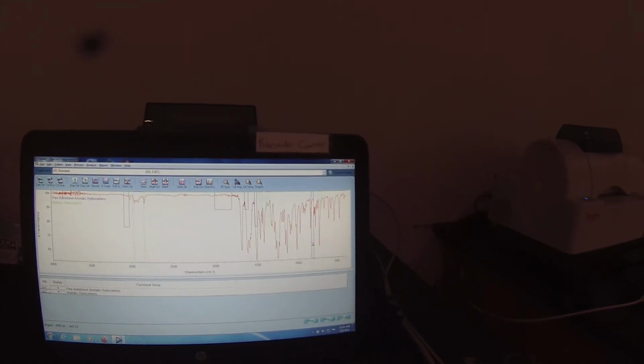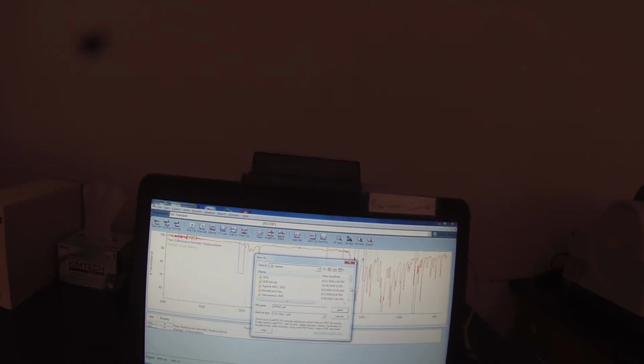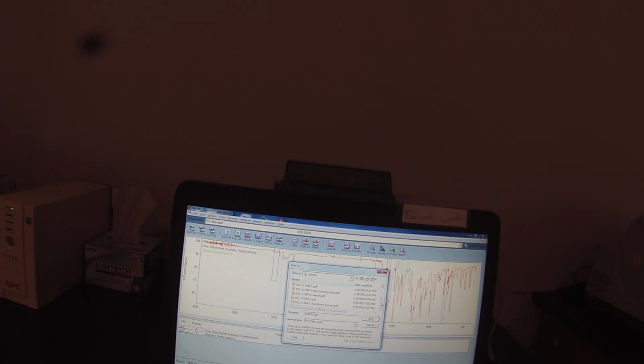And we'll also do a functional group interpretation. It thinks it's a para-substituted aromatic hydrocarbon, but it shouldn't think that because there's no peak here in this purple region, so it obviously isn't. And it thinks it's an aliphatic hydrocarbon. Well, everything's an aliphatic hydrocarbon. So this isn't very useful, but we'll print it anyway. Just for completeness.